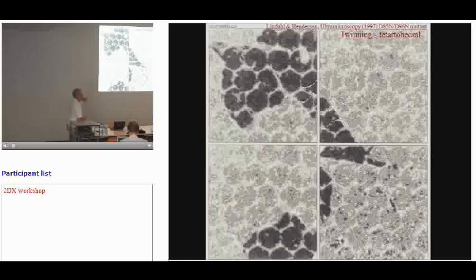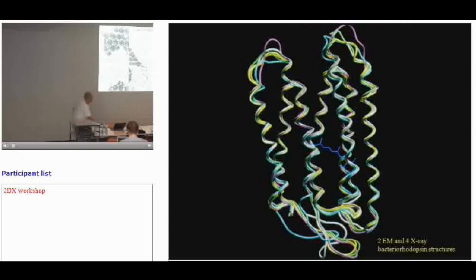And if you had processed it as a single coherent average, then all your Fourier components would be the average of the amplitude and phases of 4 different spots, unrelated. Twinning is something that's worth keeping in mind, actually. And one way of doing that, of course, is to do multivariate statistics on all the unit cells, because it will pick them out without you having to specifically test for them.